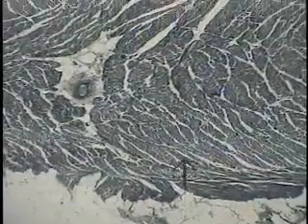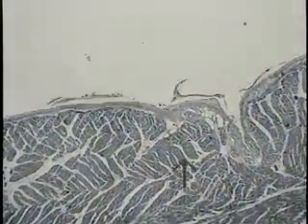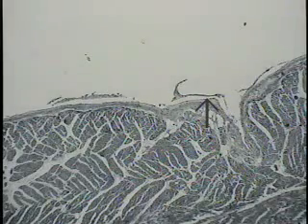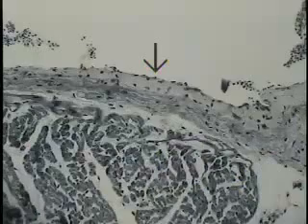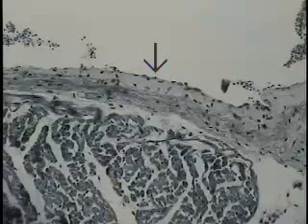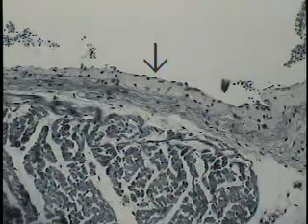So let's retreat now, again noticing the interwoven pattern, the arrangement of the cardiac muscle cells through the myocardium. You can see the various directions this interwoven muscular pattern takes. And then, beginning with the endocardium, examine it at an increased magnification. This is a demonstration of the endocardium seen at a slight increase in magnification.